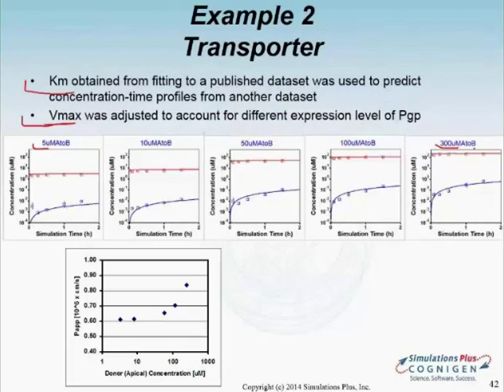different doses of digoxin. And it also nicely reproduced the nonlinear dose dependency of the measured apparent permeability, as shown in this plot down here. The measured apparent permeability was increasing as the PGP was getting saturated with increasing dose.